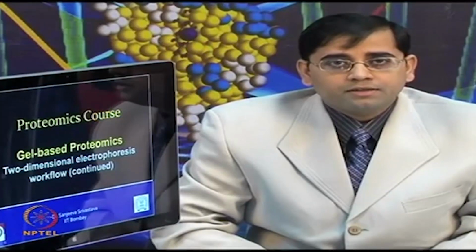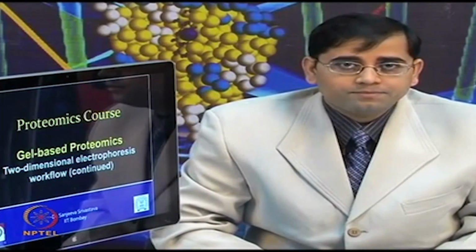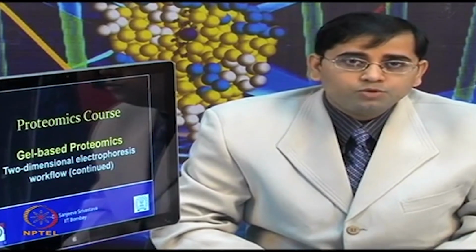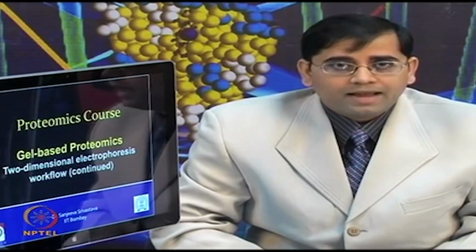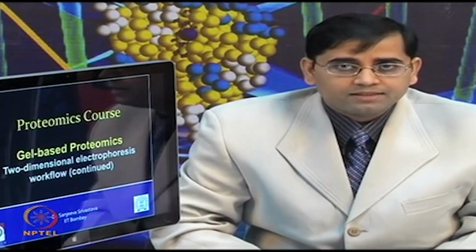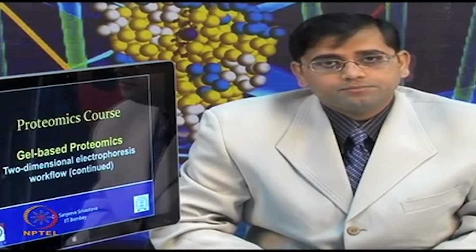As I mentioned, gel-based proteomics includes various techniques such as SDS-PAGE, blue native PAGE, two-dimensional electrophoresis, and advanced forms of electrophoresis such as difference gel electrophoresis, or DIGE.